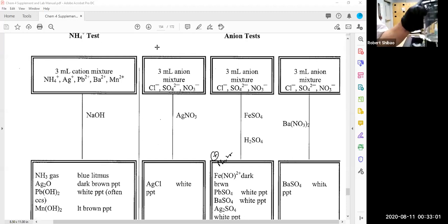And so I'm going to take my beaker here. I removed the lid, and I'm just going to pour in my sodium hydroxide. This little medicine dropper is so slow. And so I have plenty. I have more sodium hydroxide than unknown in there, it looks like. And then I'm going to cover it. I got a white precipitate for unknown B too. You can see there's a white precipitate down there. And then I'm going to gently mix it like this. I don't want any solution to splash up and hit my litmus. I want the gas to slowly rise up and then turn it blue.